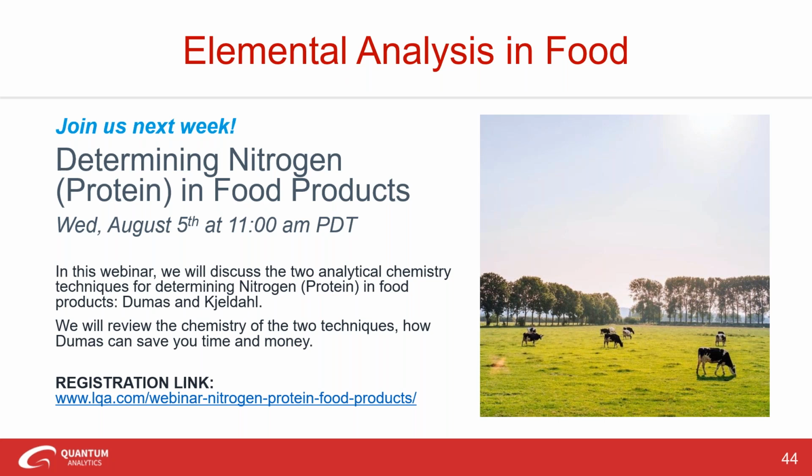Awesome. I figured if anyone knows the answer to that, it's you, Brian. All right, let's keep going. How is benchtop XRF different than micro XRF, and is one better than the other?